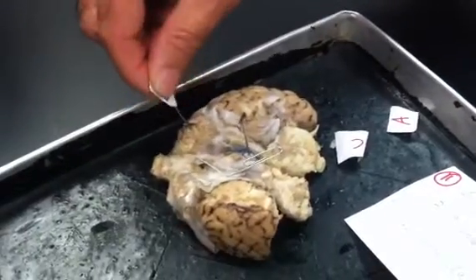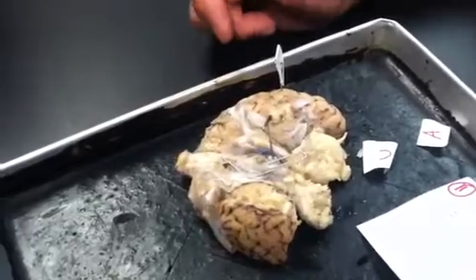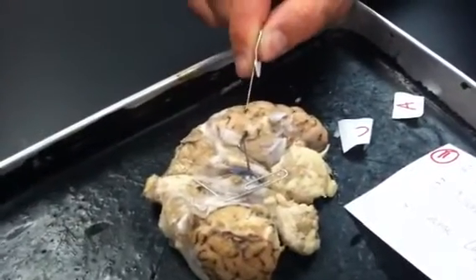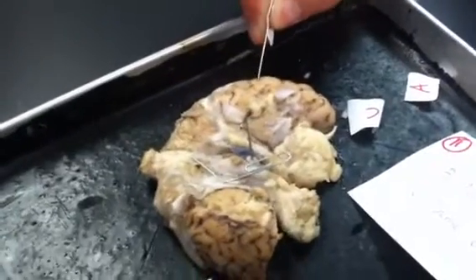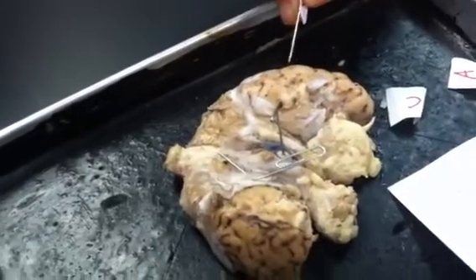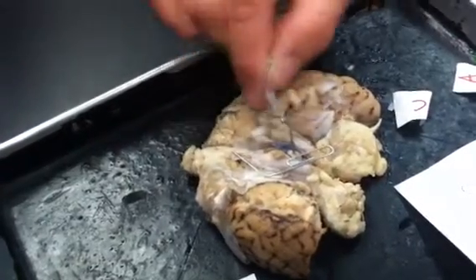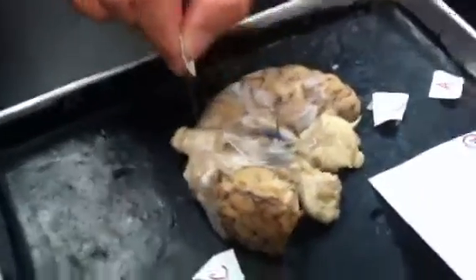And this is what? Well, what's the whole thing? The big thing? The cerebrum. Left cerebral hemisphere. Is it the left or the right? It's left. And then what is one of these darker areas here that is marked by a blood vessel? That's a sulcus, sulci plural. And then the ridge between the sulci, the gyrus singular. What's this thing sticking out here? That's the spinal cord. And then once you know the spinal cord, everything falls into place. What's that? Medulla oblongata.